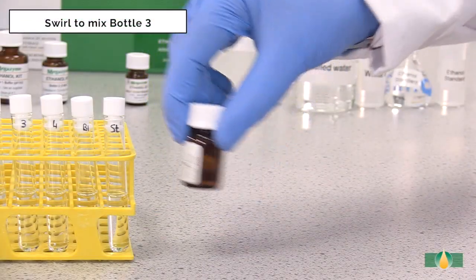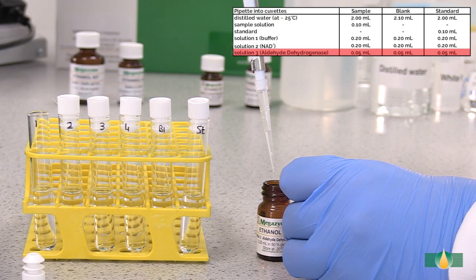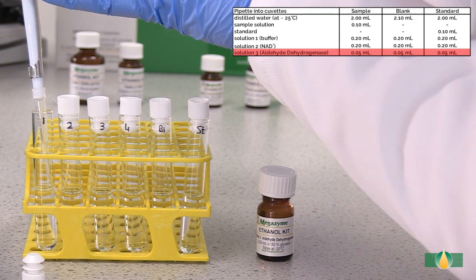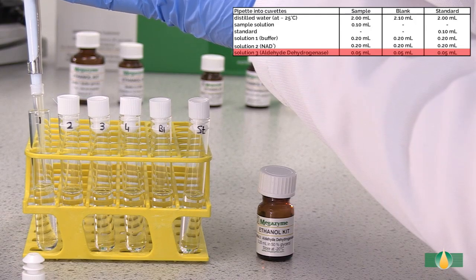Swirl to mix the contents of bottle 3. Carefully pipette 50 microlitres of solution 3 into all assay tubes. This enzyme can be quite viscous, so ensure pipetting is accurate.